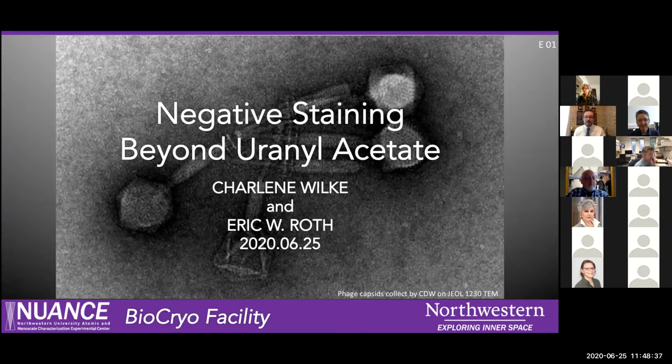Oh, so the samples are at pH 7. It depends on your sample. If you've got biological samples, PTA can work with some viruses, but it will also disrupt some viruses and some membranes. So it's going to take some trial and error for your specific sample.